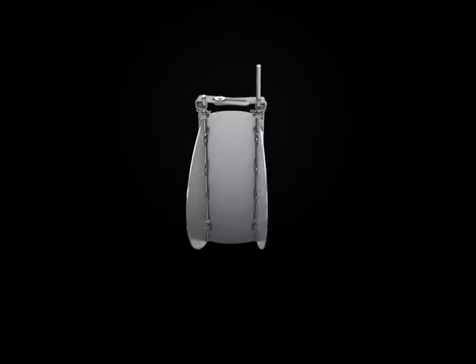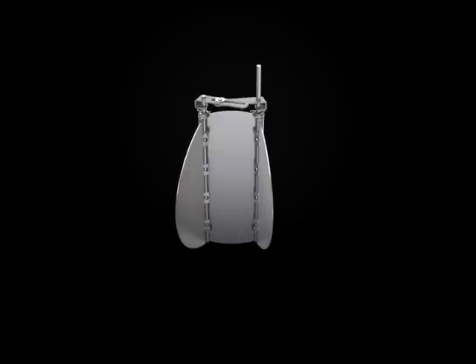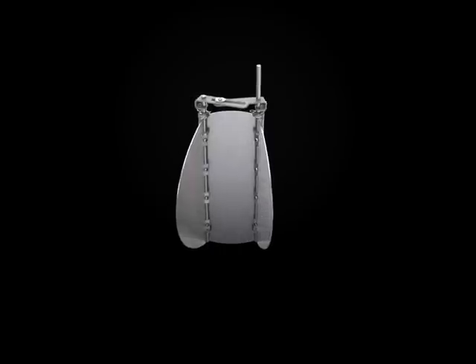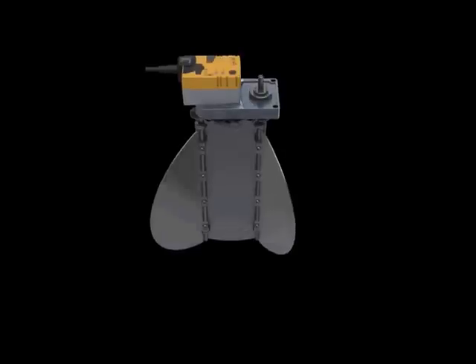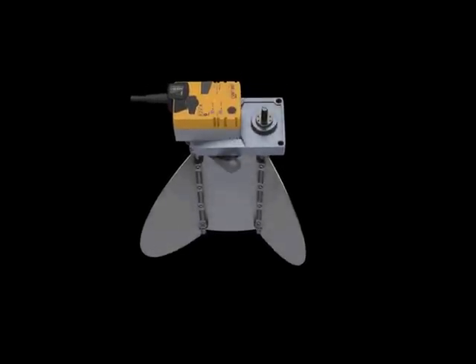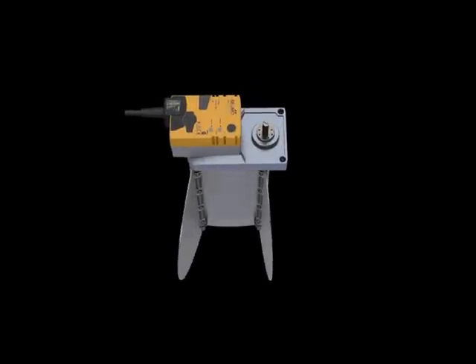Turndowns of up to 10 to 1 while maintaining accuracies of 5% of reading over the flow range ensure precise airflow control for the AccuValve. The high speed electric actuator delivers superior speed of response.